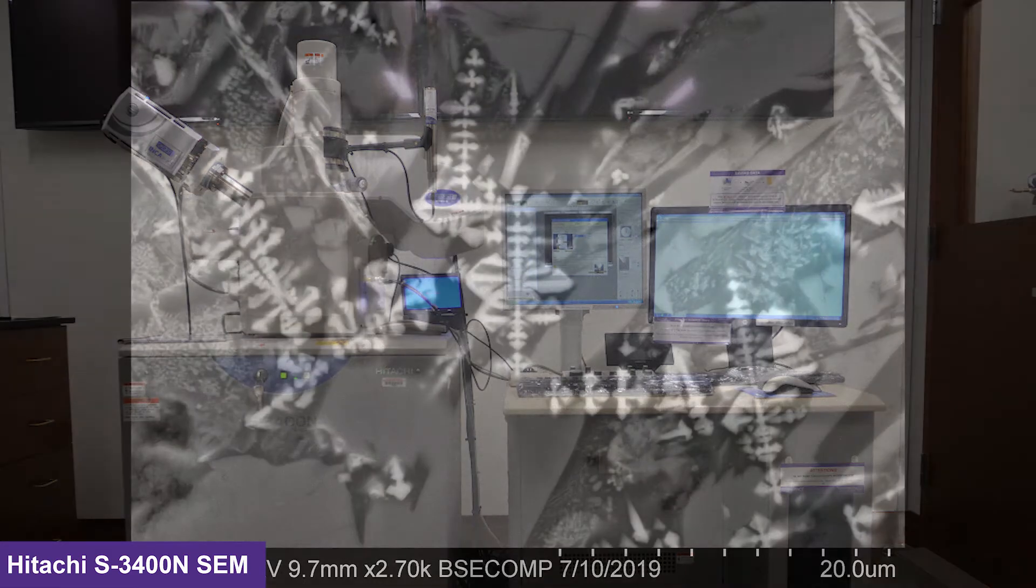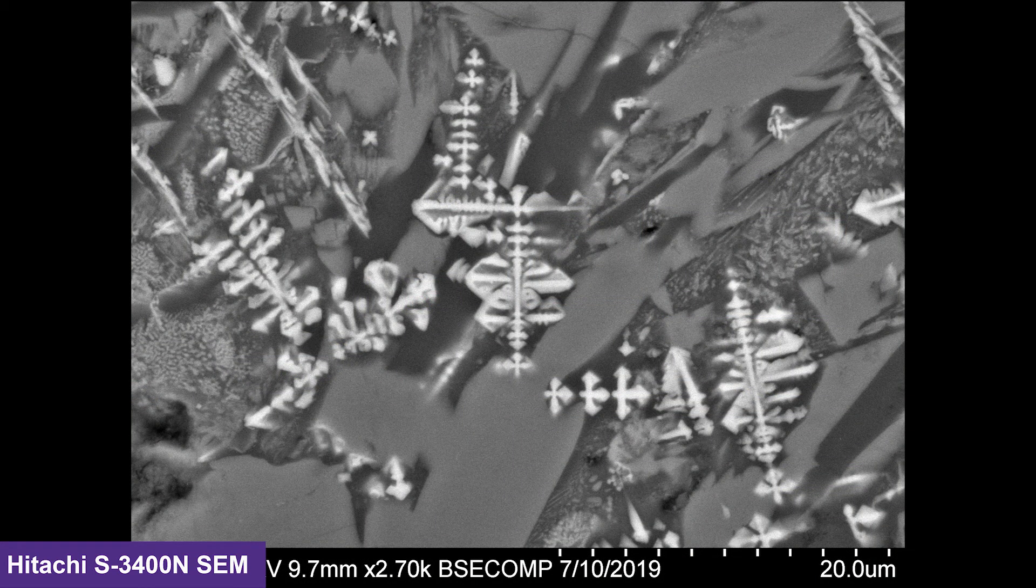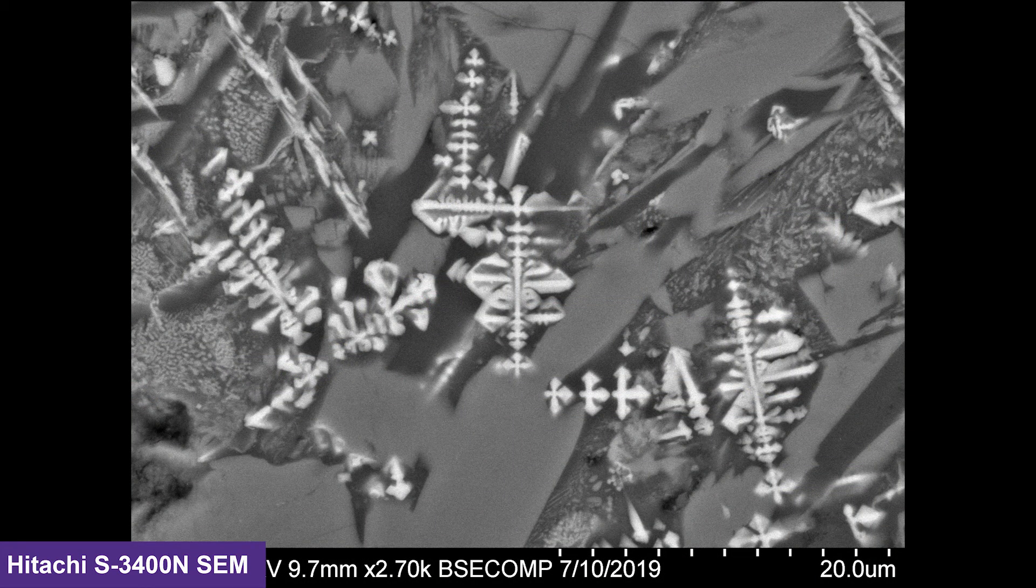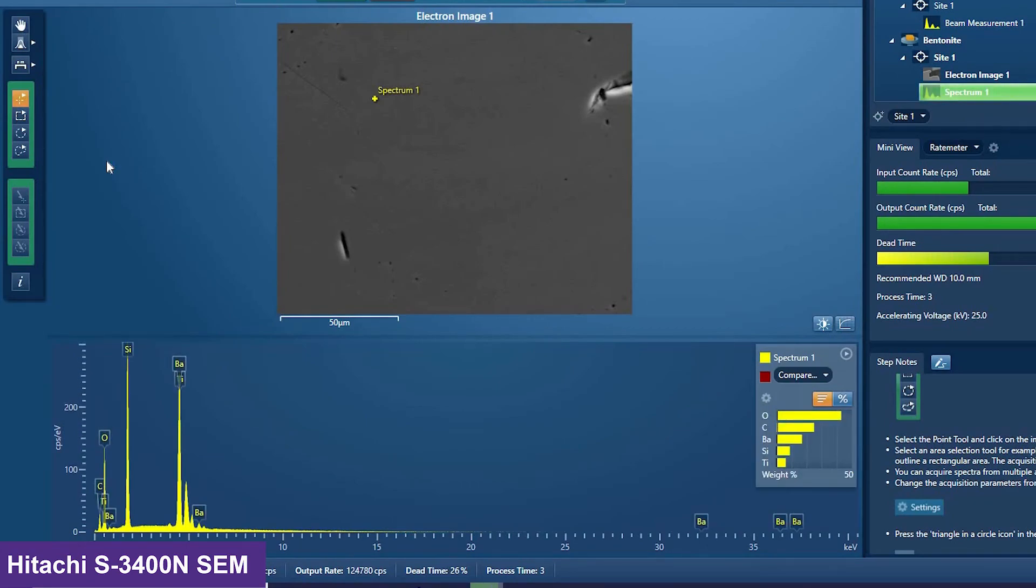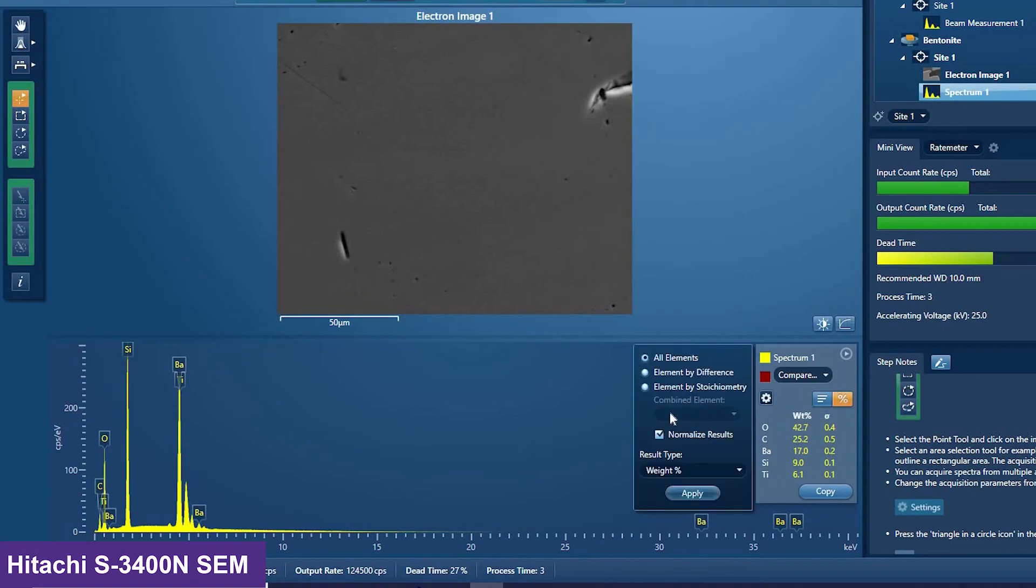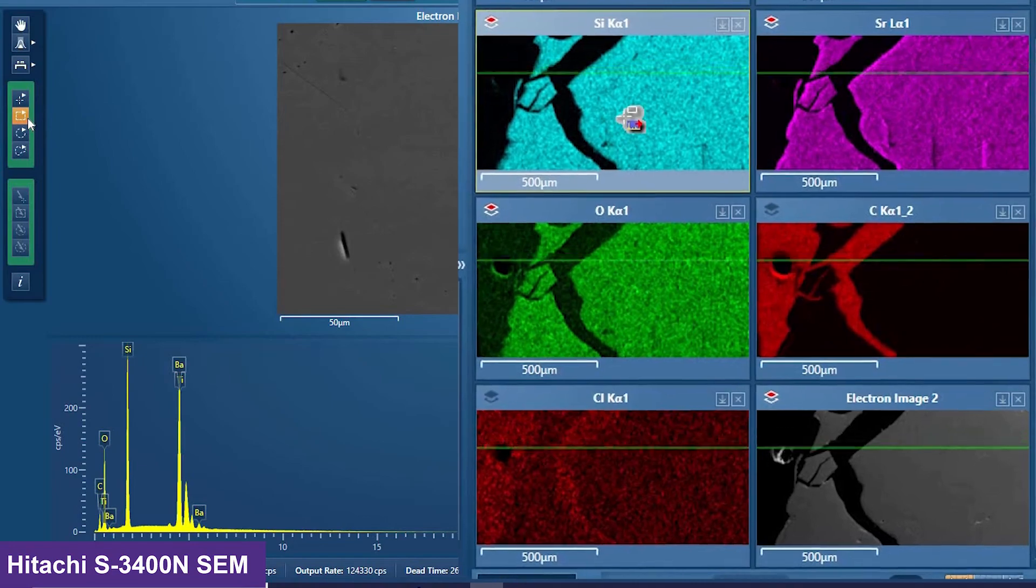The 3400 has an SE detector along with a BSE detector for compositional contrast imaging. This microscope, along with many of our other SEMs, is equipped with an energy dispersive X-ray spectroscopy system, or EDS, which allows you to perform elemental analysis as well as elemental mapping.